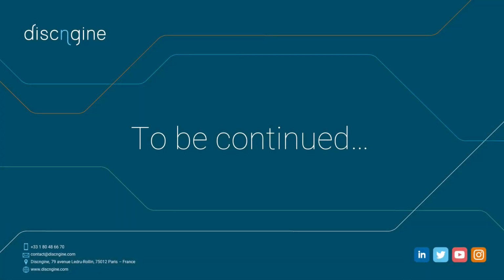In the following video, you will see how to design and register a Pipeline Pilot protocol for the SWAPP.